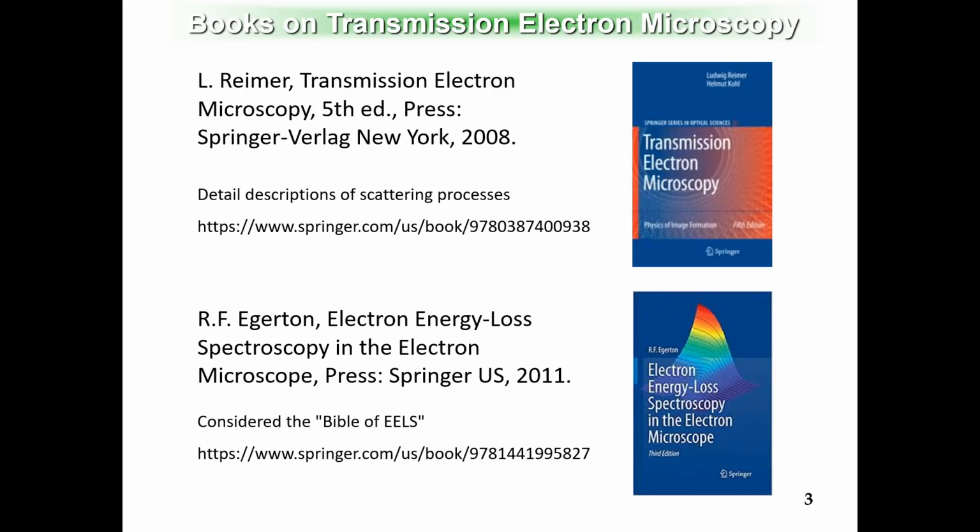Those two books I read, I don't know how many times, but I think they are the Bible for the TEM field. One book is for the transmission electron microscopy, focused on the microscopy itself, in other words taking images. The other one is focusing on the spectroscopy.